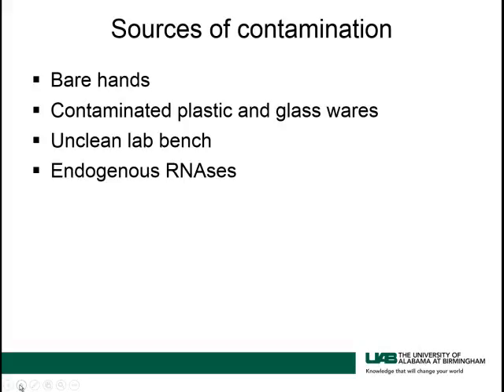Once you contaminate something, you almost have to use a detergent to inactivate them. Contaminated plastic and glassware are another source. An unclean lab bench is another source, and then endogenous RNases that are released from the cell. These are some of the many sources of contamination by RNases.